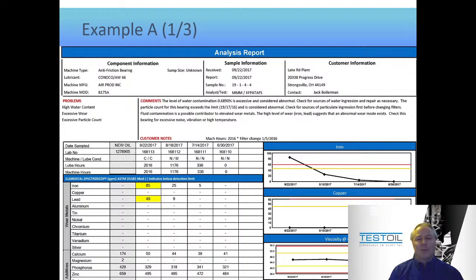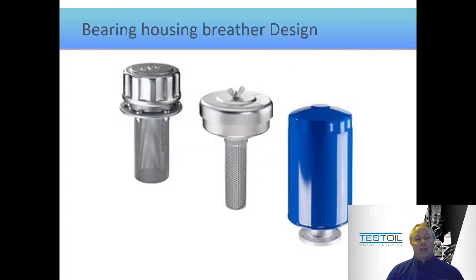And sort of the go-to answer most people have is, well, go look for why the dirt's getting in there. And that's a great answer, right? Let's go check this bearing, because I'll wager there's something obvious wrong with it. Now, it could be a fill cap is not on tight, or maybe not on at all. Could be, if this thing had a dipstick, that the dipstick has popped out and it's laying on the ground, and there's an opening into the system that way. Could be a number of points of entry into that bearing, but probably first and foremost in everyone's mind is it could be a breather, right? Let's go check the breather, right? And there could be any number of breather designs that appear on this particular bearing housing, but I'm wagering it's further to the left of this picture than it is to the right of this picture.